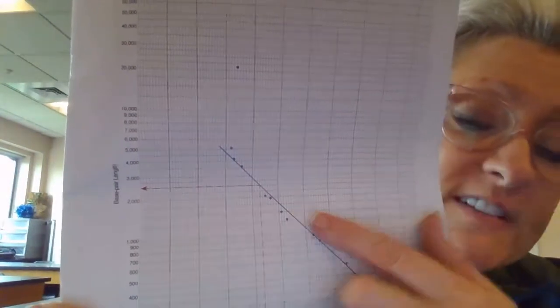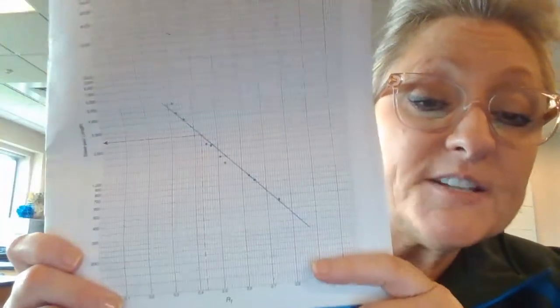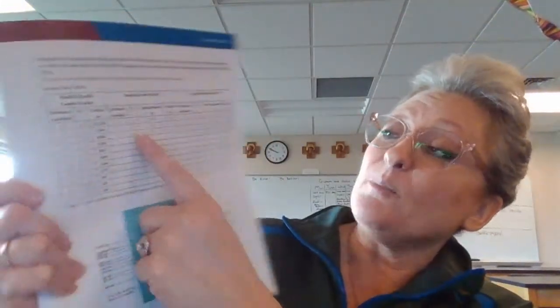So you can see the individual points have been plotted, and then a best fit line was drawn. You had one data point way up here. That's an outlier, and if you've drawn a best fit line before, you'll know you want to discount your outliers. Then we drew a best fit line through all of our data points. Now this becomes our metric for determining the base pair lengths for these other ones. We knew these, but then we had to determine our base pair lengths interpolated. That's what it means when we use this graph to interpolate our base pair lengths based on the best fit line of the known values.